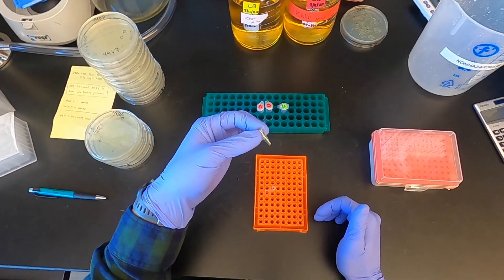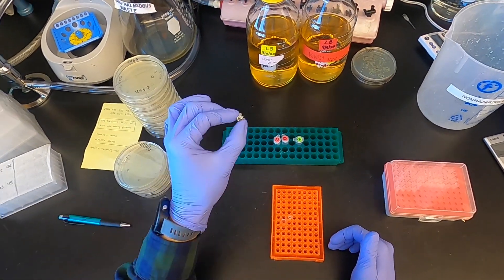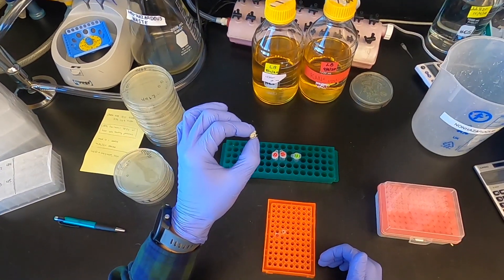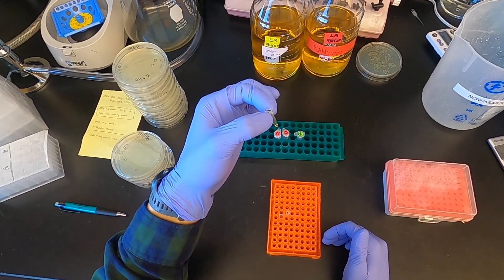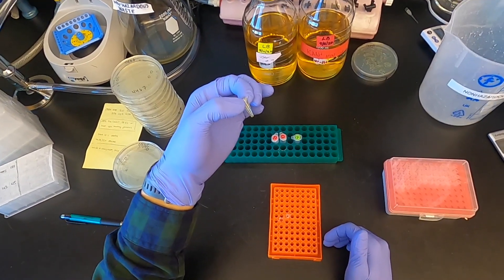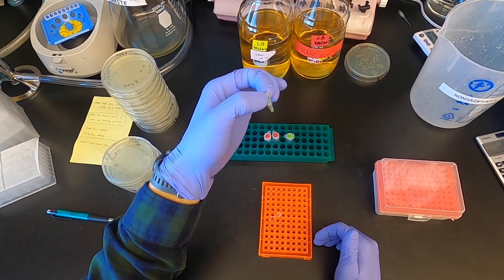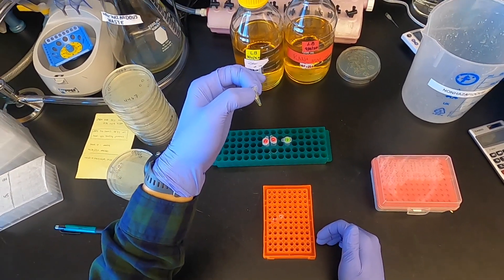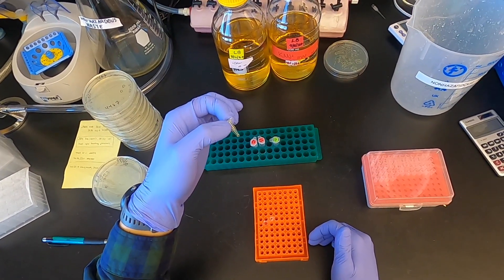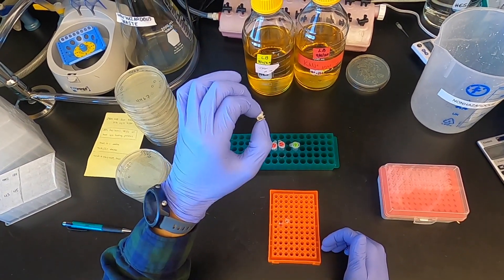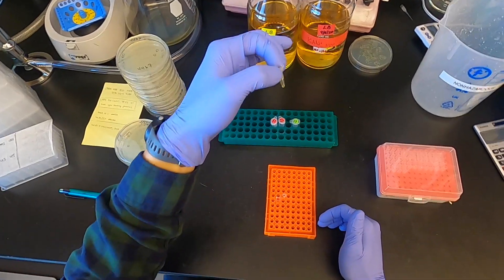I also have some T4 ligase buffer here, plus PEG 3350. We aliquot these out into 6 microliter aliquots, just because repeated freeze-thawing of T4 DNA ligase denatures the ATP. So these are single-use aliquots, 6 microliters each.